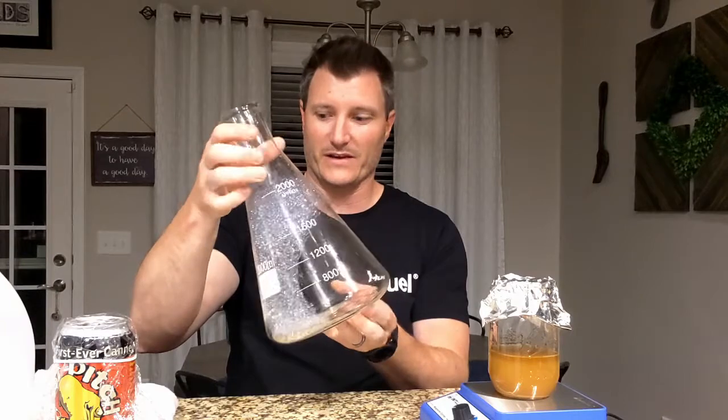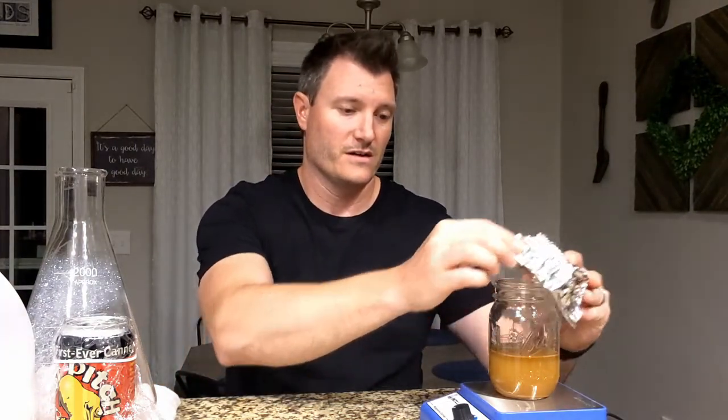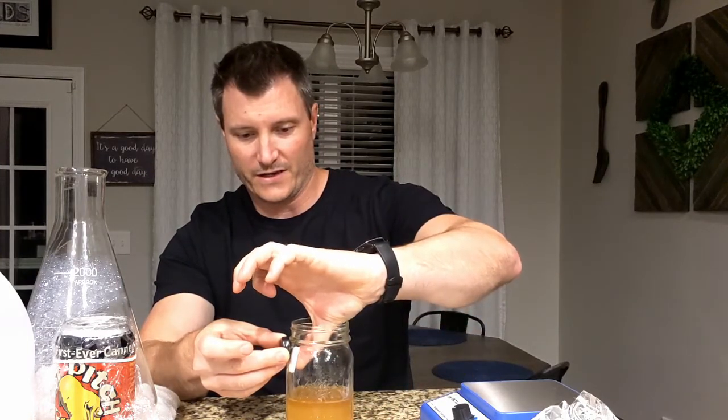We're going to ramp this up into our flask size — I've just sanitized that, there's some extra sanitizer bubbles but don't worry about that. First thing we're going to do is take the lid off and get the stir bar out. An easy way to do that without cracking the glass is to take a magnet on the bottom — the stir bar will come right up along with it, stick to the side, and you can set it down. Slide it up to the top and put it right in sanitizer so it's ready for next time.